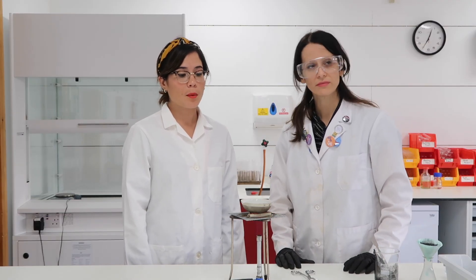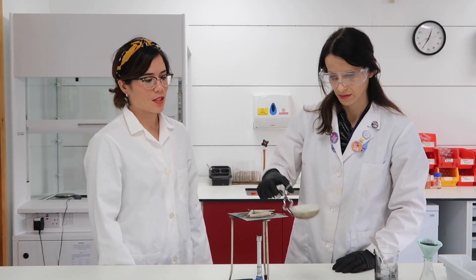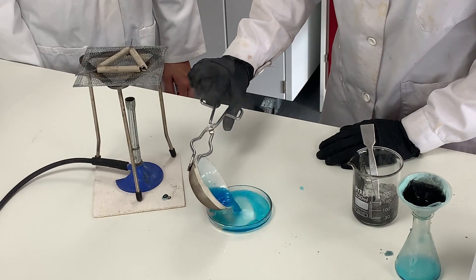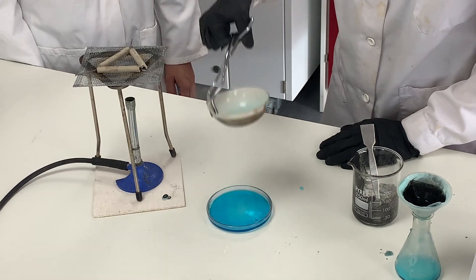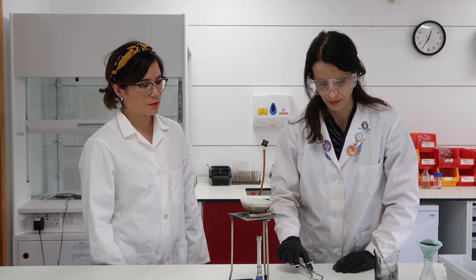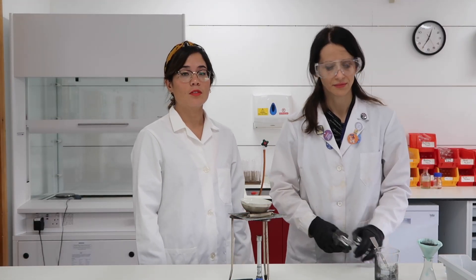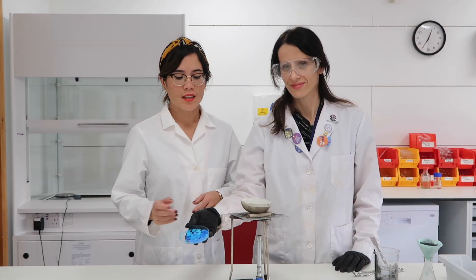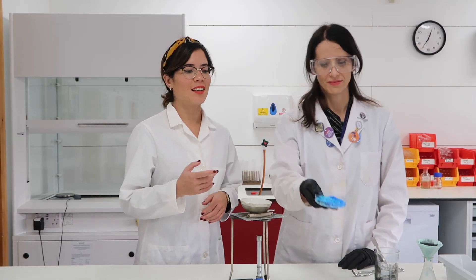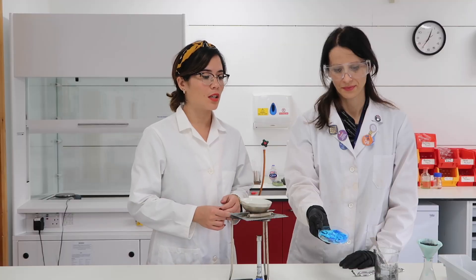So we've evaporated some of the water and now we can turn off the gas and pour the solution into a crystallizing dish. We leave it for one to two days. And then, to show you something that we produced earlier — here are our finished products. The copper sulfate crystals are absolutely beautiful.